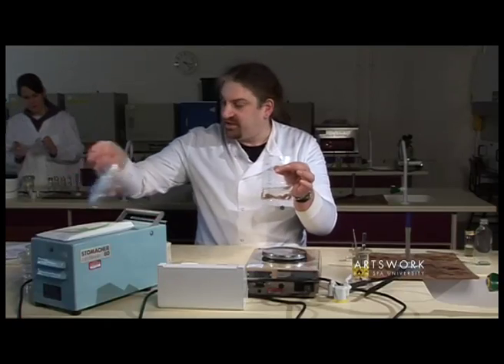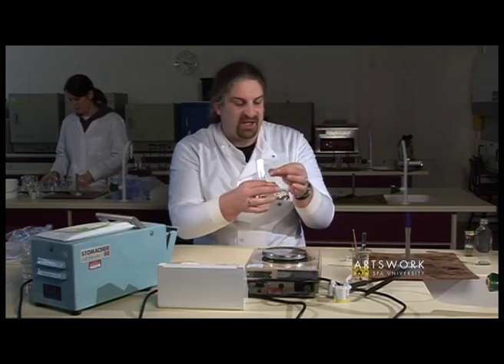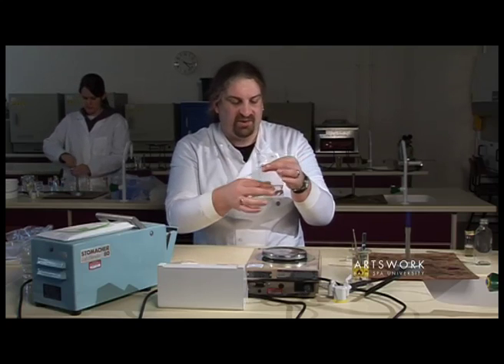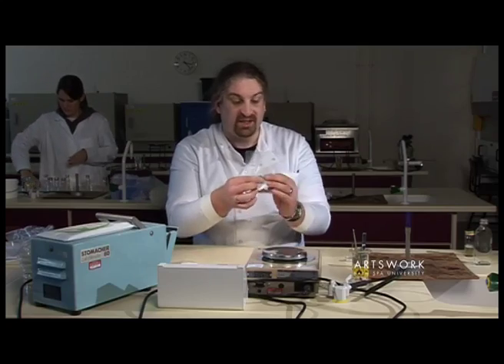The next stage is to stomach that sample, and we use a stomacher. What that has inside is paddles, which will just pulverise that sample, mix up the food with the liquid, and wash any bacteria from the sample into the liquid itself.